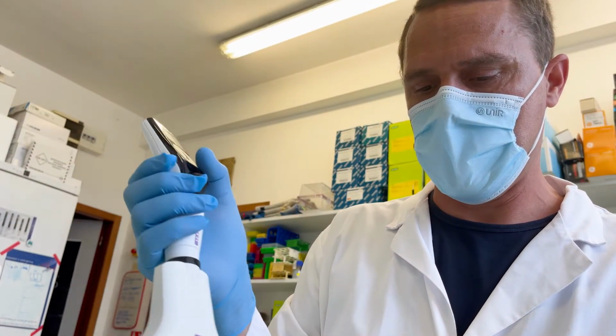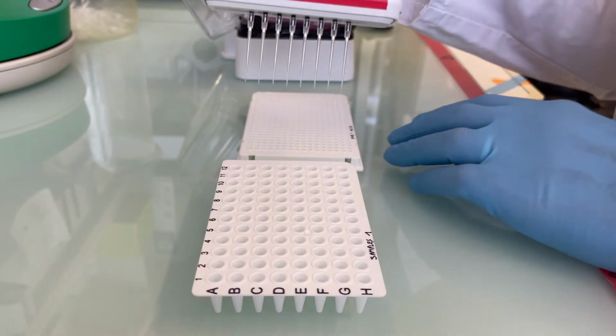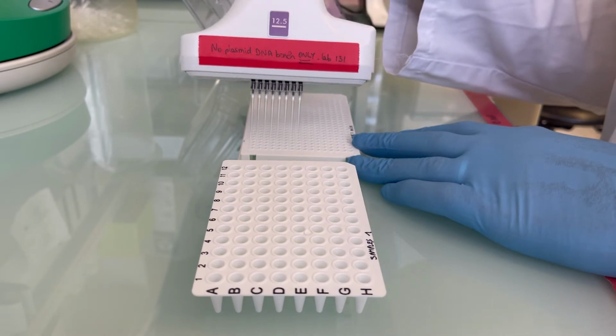I am Gaël Petitjean. I am a research associate in the team and I have worked on HIV-1 infection for almost a decade now. I work on different aspects of HIV-1 infection and all the interaction between HIV and the cell host. For our study, we have a lot of applications, from qPCR to the amplification of the HIV-1 genome at the single molecule level or in single cell level, and that's why we have a lot of applications that need high throughput.